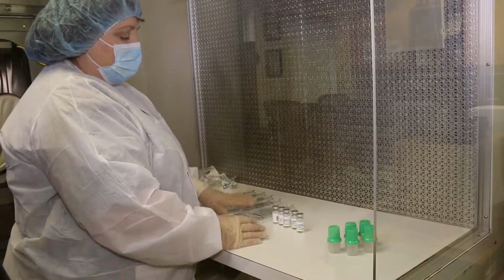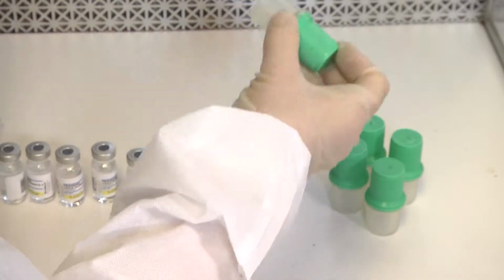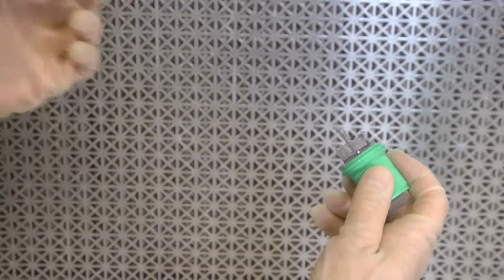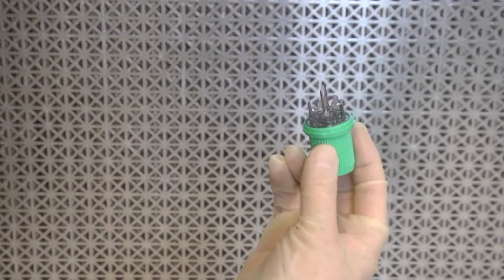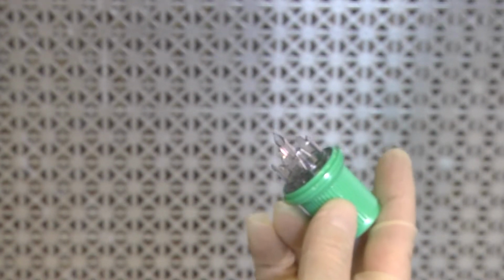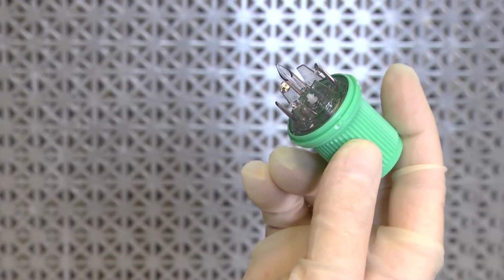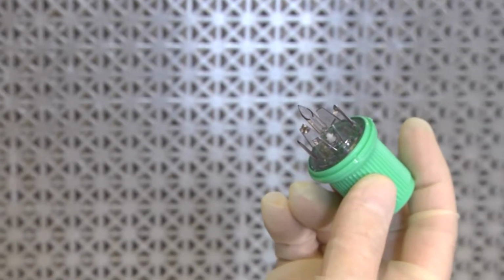Okay, now that the bags are clean and the vials are clean, it's ready to attach the Add-Ease vial container. So simply twist off the clear portion, and that leaves showing the spike of this Add-Ease. Now it's like any other needle. The eye of the needle, which if you can see it clearly, has to face your eye. And this is the way you have to attach it to the vial.